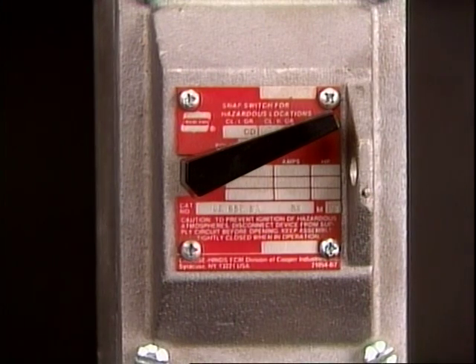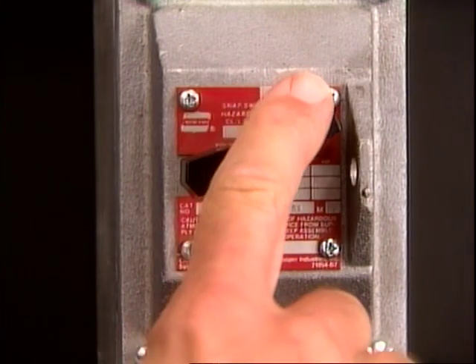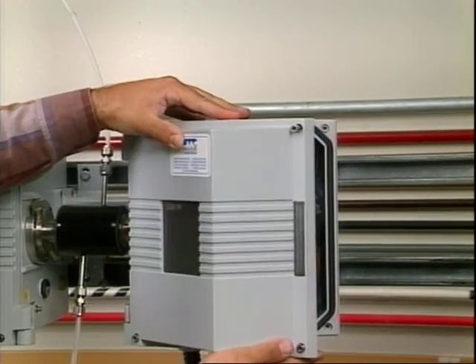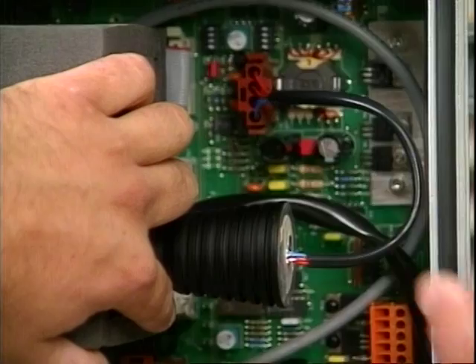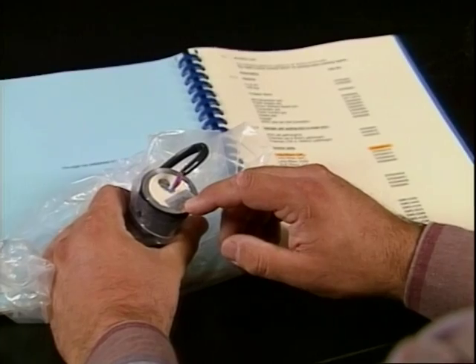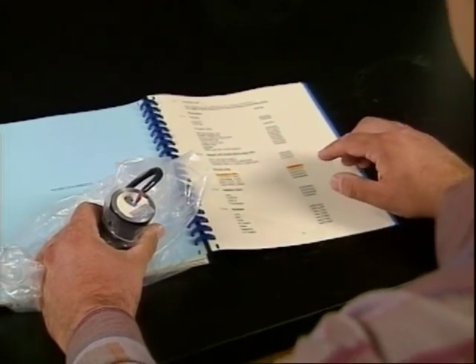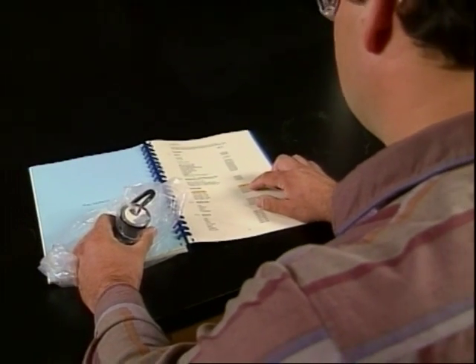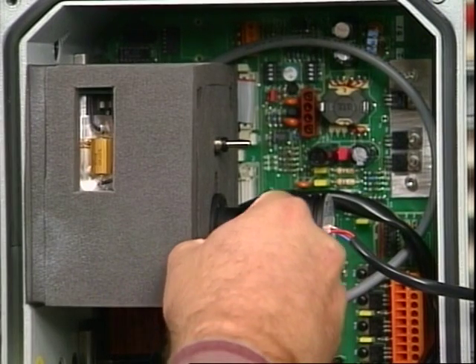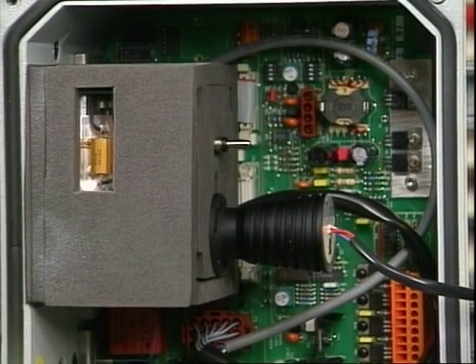To replace an infrared or visible light analyzer lamp, first de-energize the analyzer and wait until the lamp assembly cools. Remove the lamp housing cover. Unplug and remove the lamp assembly. The replacement lamp should be selected according to manufacturer's specifications and the analysis requirements. Replacement lamp installation is usually the reverse of lamp removal.